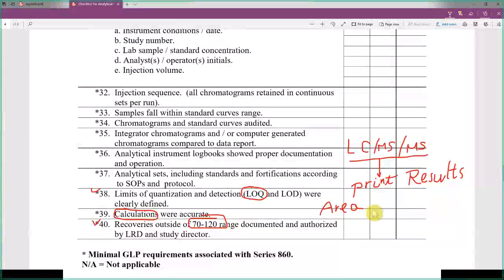You need to give all calibration parameters, or how you do the calibration. It's linear regression. Do you use the weight, and what kind of range do you use? So people can pull it out themselves and do the same thing.